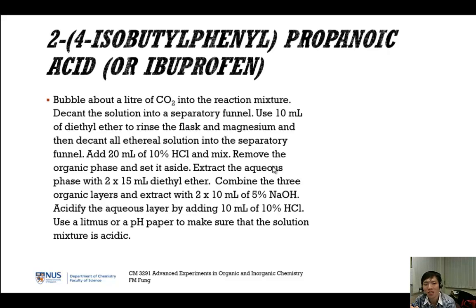After extraction, the conical flask you just place aside, label using a marker. Sometimes you forget whether it is aqueous or organic. Okay, of course you can sniff, but it's not healthy. Put it to one side, label everything until you're done with everything. When you're really sure that you have your compound, you can discard the rest into the appropriate waste container, chlorinated or non-chlorinated, aqueous.